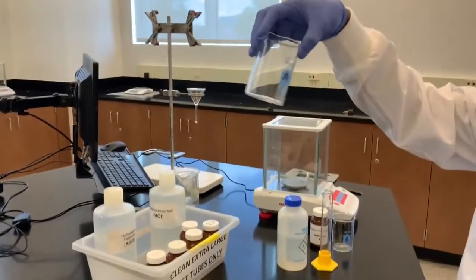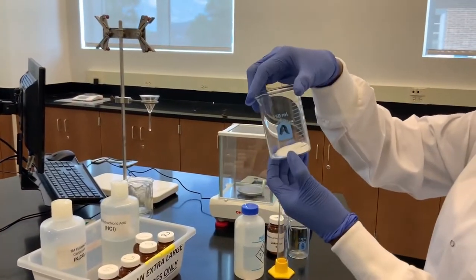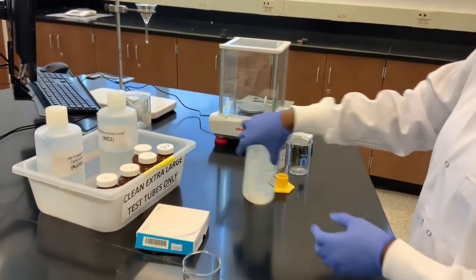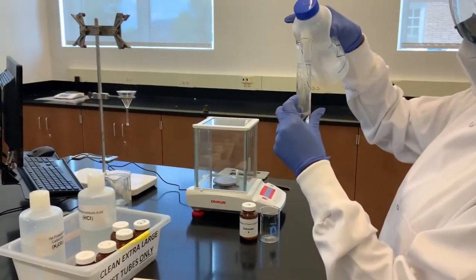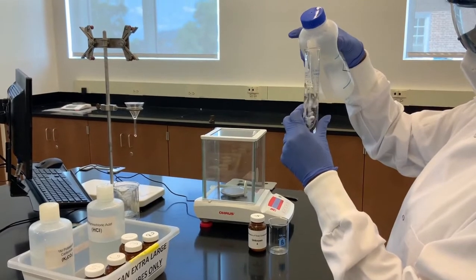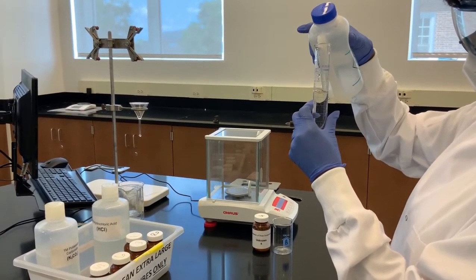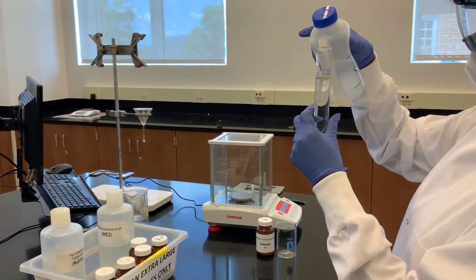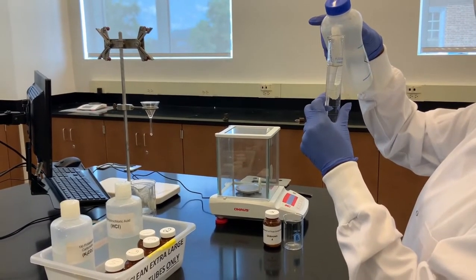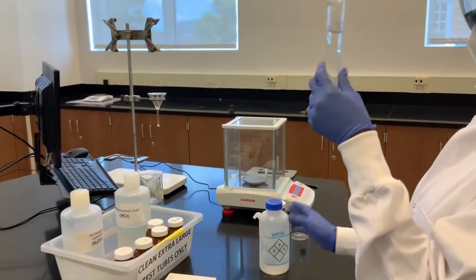This is my mixture, the unknown 4. All I'm going to do is measure 50 ml of distilled water. Try to reduce the bubbles. About 50 ml.